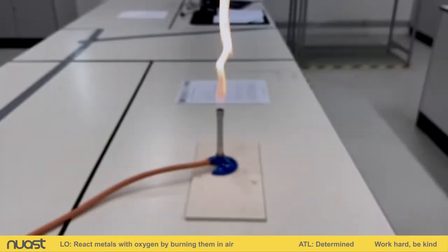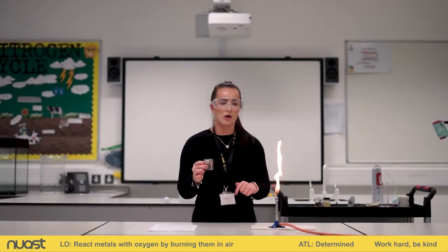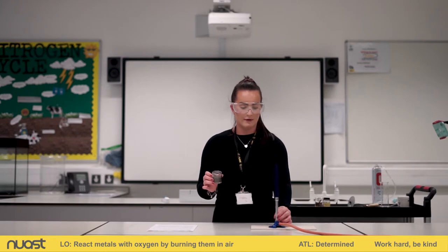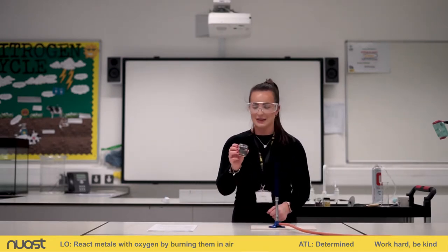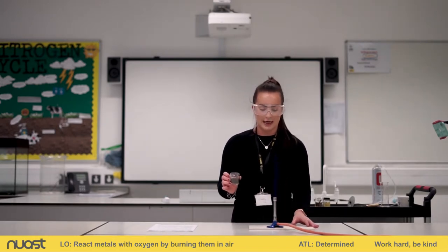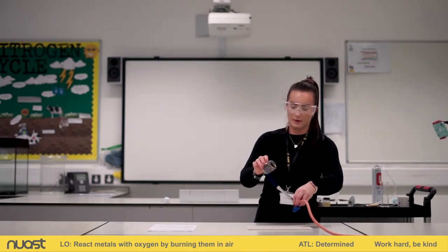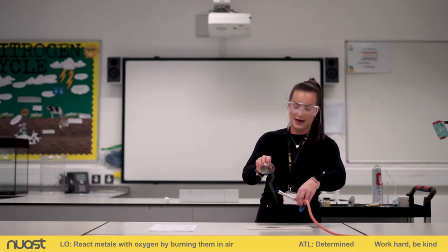Okay, so it's going to be quite hard to show you what they look like after, but I can always hold the camera over so that you can see what they look like. But I'm going to put this onto a blue flame. I'm going to have to be able to multitask here to be able to hold my Bunsen burner at a tilt and sprinkle some of these through the flame. Okay, I'm going to try and collect them on this heatproof mat that I've got here. So you can see some sparks there.